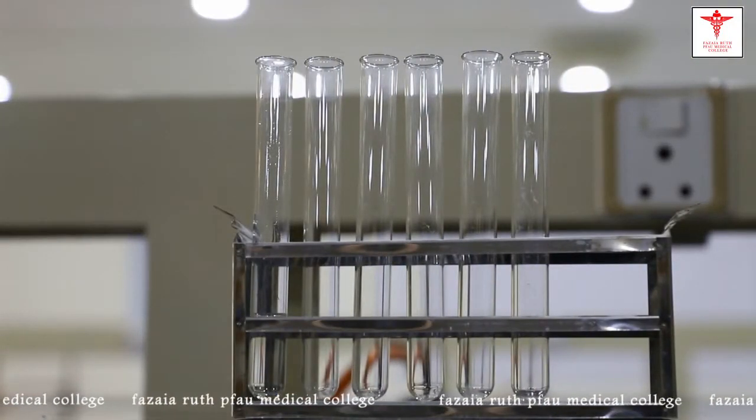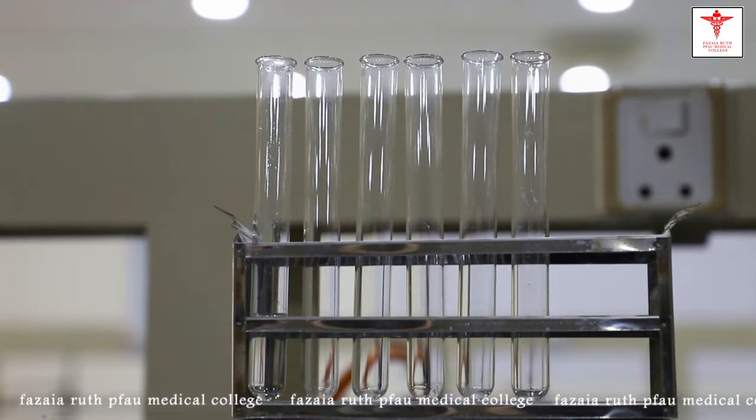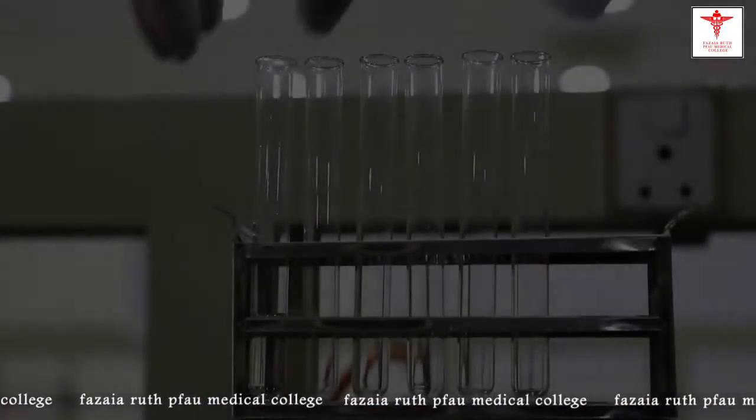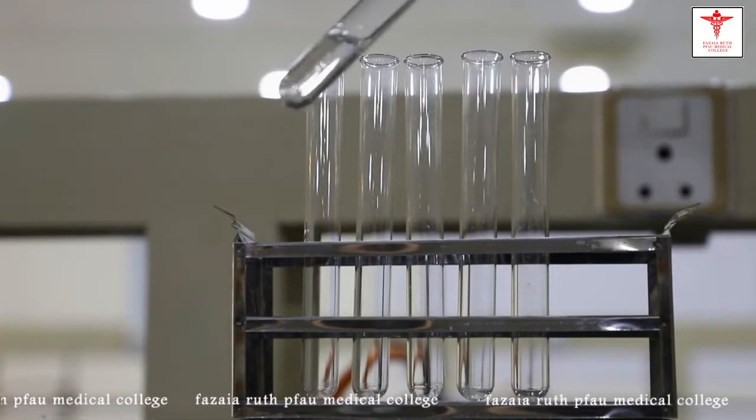And now we'll add sulfuric acid. And mind it, this is concentrated sulfuric acid. So we'll add 2 ml of concentrated sulfuric acid along the wall of the test tube.